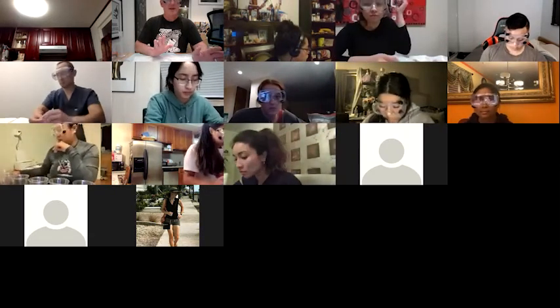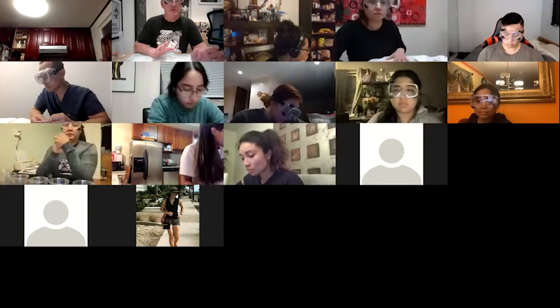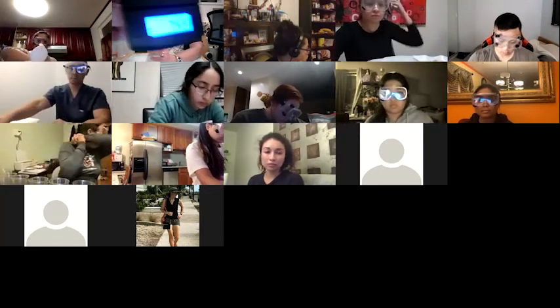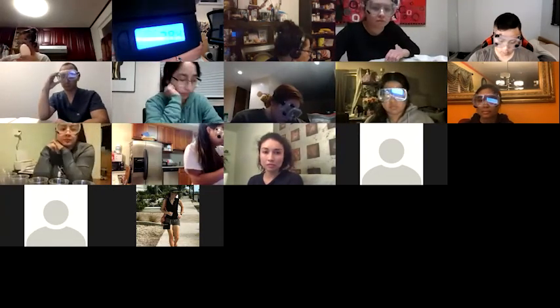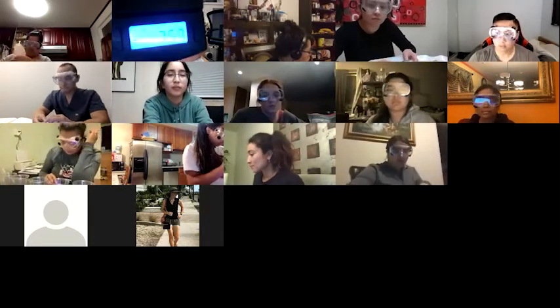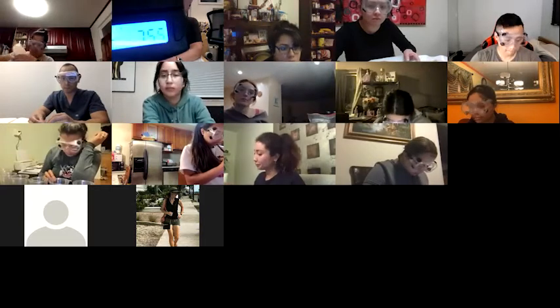The one on the left tells you what units. What's really important is that it says grams. Can you see that? It should say grams.